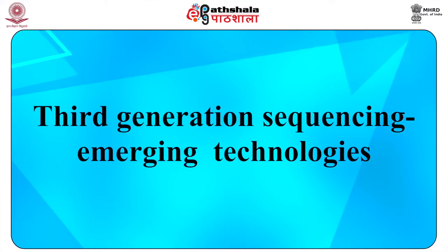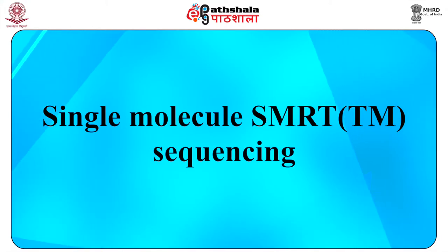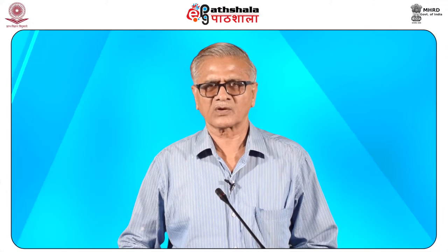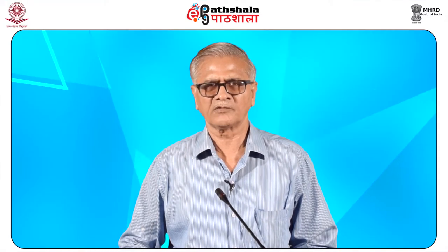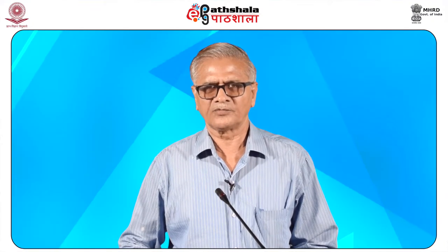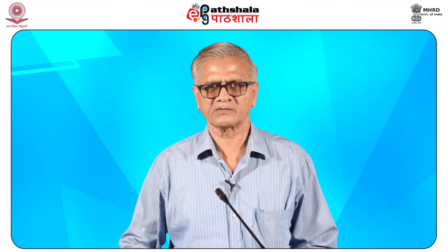Now we come to third generation sequencing, or emerging technologies for sequencing of DNA. In this, the first method is single molecule real-time sequencing, in short called SMRT. SMRT is based on the sequencing by synthesis approach. The DNA is synthesized in so-called zero mode waveguides, small well-like containers with the capturing tools located at the bottom of the well.